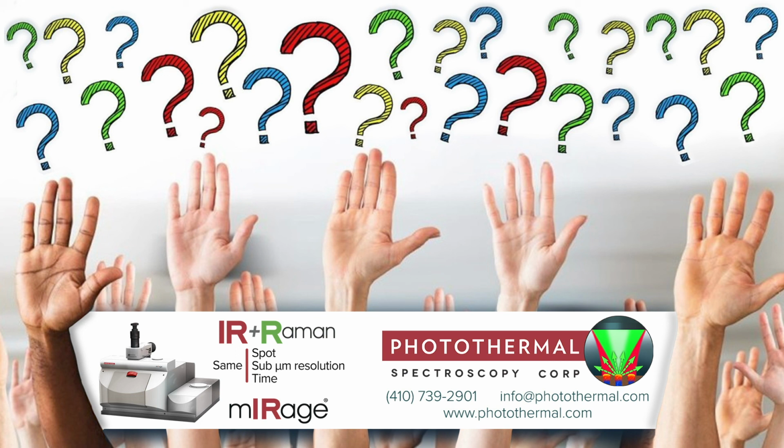That means the signal that we extract is also modulated, and that's separate from the Raman signal and also the fluorescence signals, which are not modulated. So by using a lock-in amplifier, we can efficiently extract only the infrared portion that contains the infrared spectrum information, whilst completely excluding any fluorescence background signals.